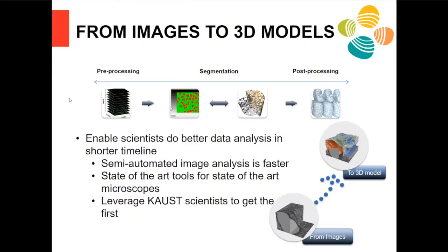I'll be showing you today just a quick overview of how we do 3D reconstruction. So let me first share my screen. All right. So what is 3D reconstruction in this case? Like Glendon explained in his presentation earlier, we're moving from images into 3D models or 3D surfaces. And we came up with our own workflow in the lab. We use Avizo and ilastik, and we go back and forth between those two tools. And today I am going to show you the fastest way of doing segmentation.